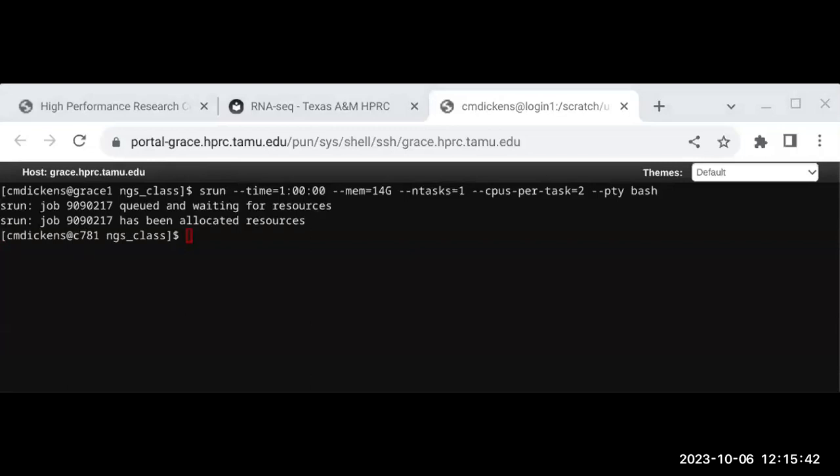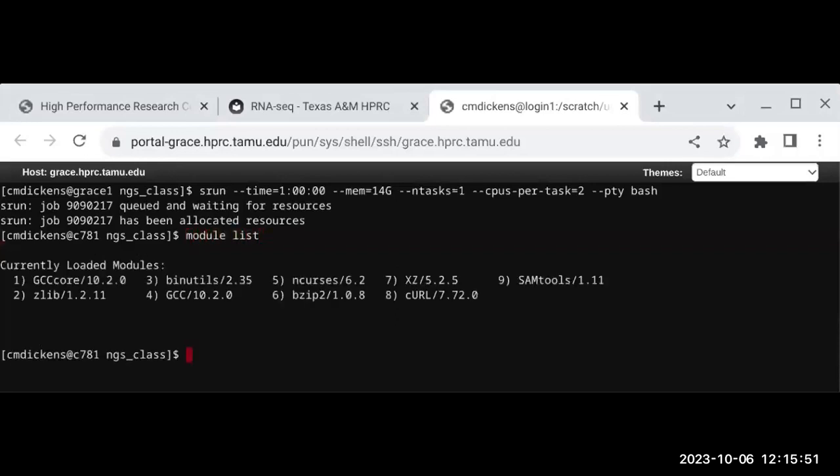The next thing we want to do is, we're on the compute node, there's no connection to the internet. Load the web proxy module. Module purge. There's not really a version here. It's a module to connect to our web proxy. So just do module load web proxy. You may need to do module purge also.